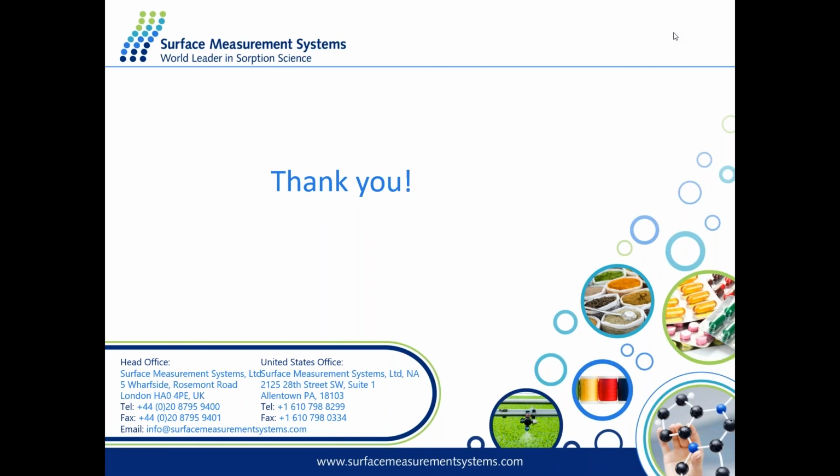For the sample mass, we need to understand the value of the BET surface area. Typically, if you have a sample with a very high BET surface area, we need only a little sample, about 10 milligrams. If we have a BET surface area that's quite low, maybe about 10 meters squared per gram, then we need more material, maybe from 50 to 100 milligrams.